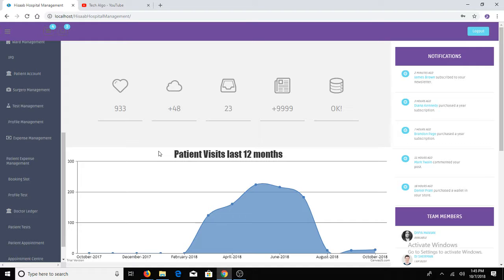The basic thing that we have in this software is the centralization of the patient, so that whenever we try to track the patient, we do not get disrupted about where to go or what to have, or what the actual track of the patient is, if you really want to do it that way.